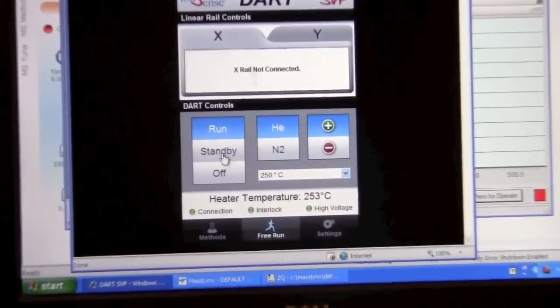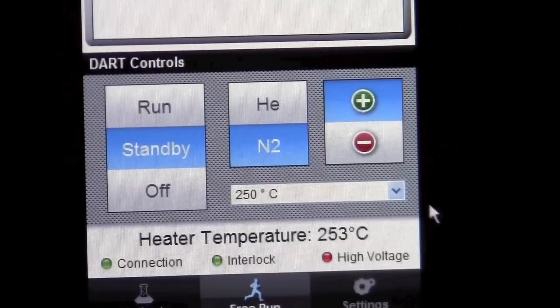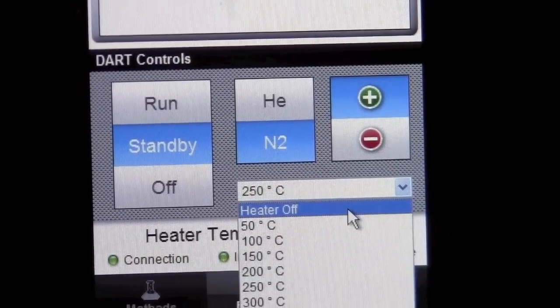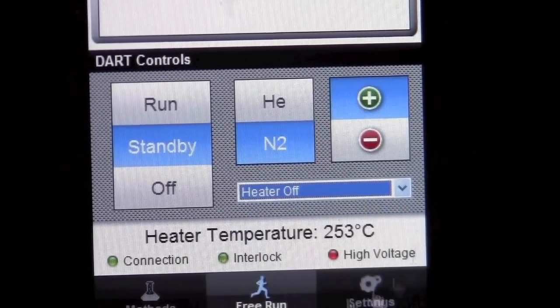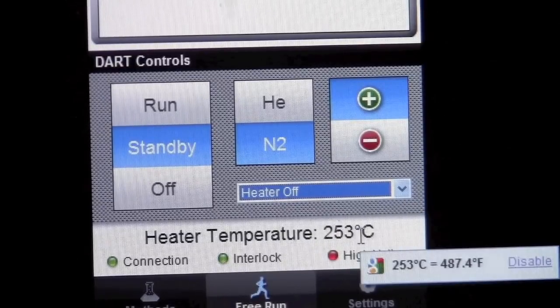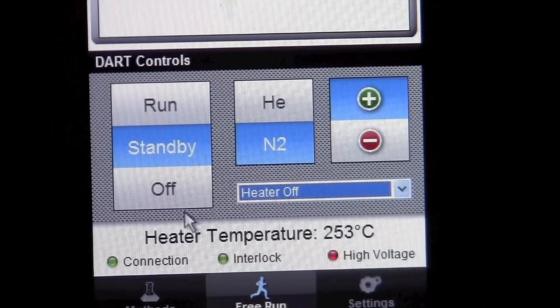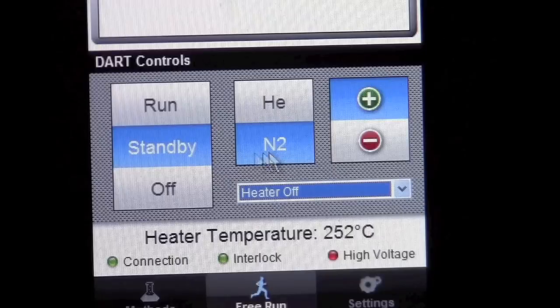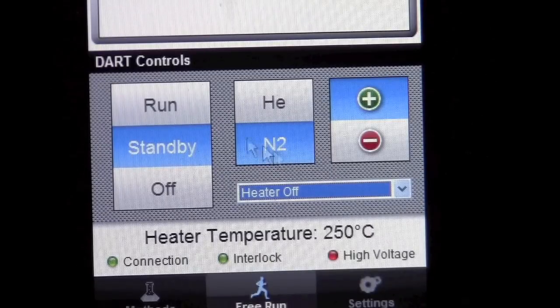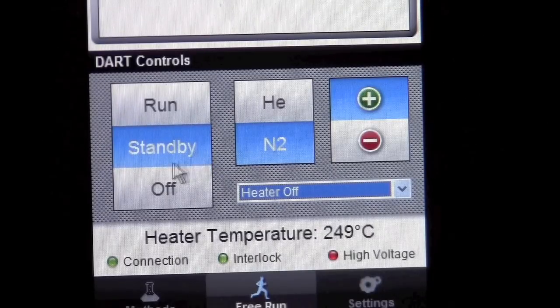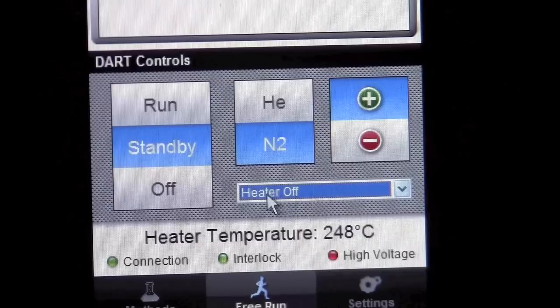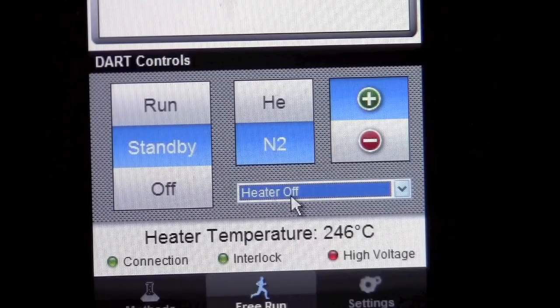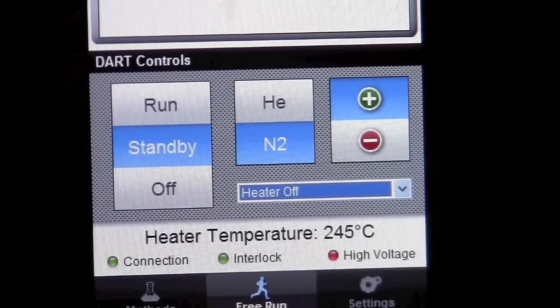You can put it on standby and turn the heater off. After the heater temperature has cooled down to room temperature you can set it to off. That will help us conserve nitrogen. But please remember to at least put it in standby so we don't waste helium. In this case we'll leave it on nitrogen until the source has cooled down and then we're finished.